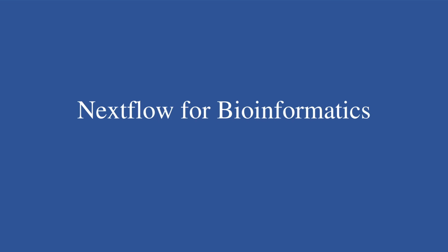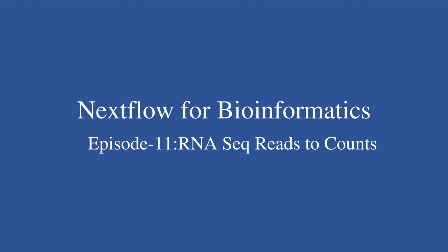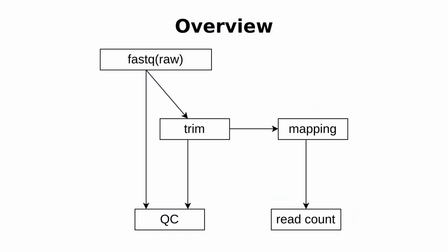Hi everyone, welcome to another episode of my tutorials on Nextflow for Bioinformatics. In this video, we are going to look at how to generate RNA-seq read counts. So that means we will get our RNA-seq data and then we are going to generate read counts. All right. So this is what we are going to do.